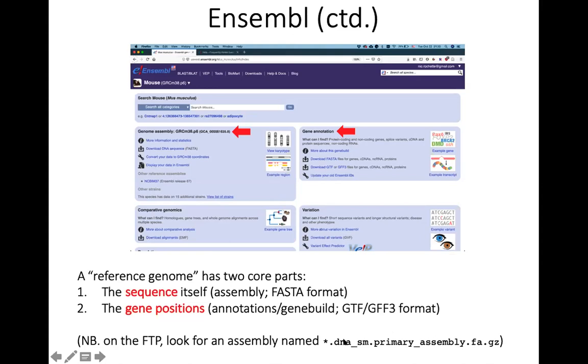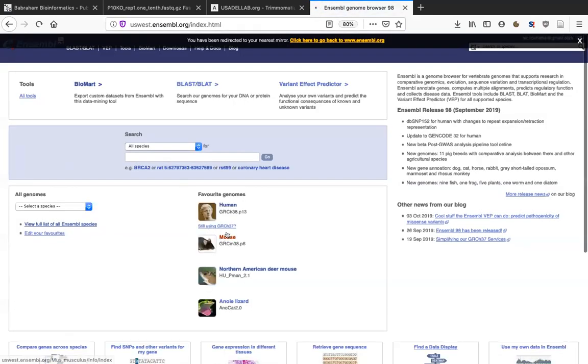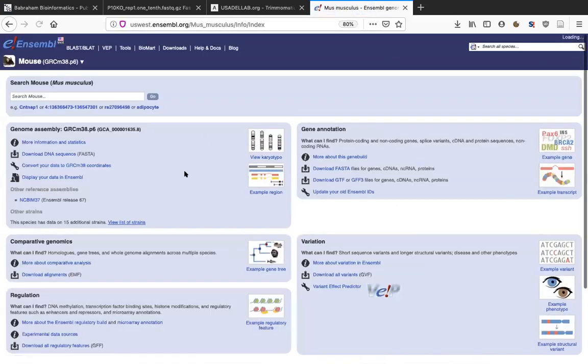One note is, if we follow this link here, which I'm not going to do now because we don't have time, but I invite you to do so. What I mean by following this link is that in this section you just have a download the file button. I might just do it so that you can see. Okay, so I click on mouse and I arrive on this page that we've just seen.